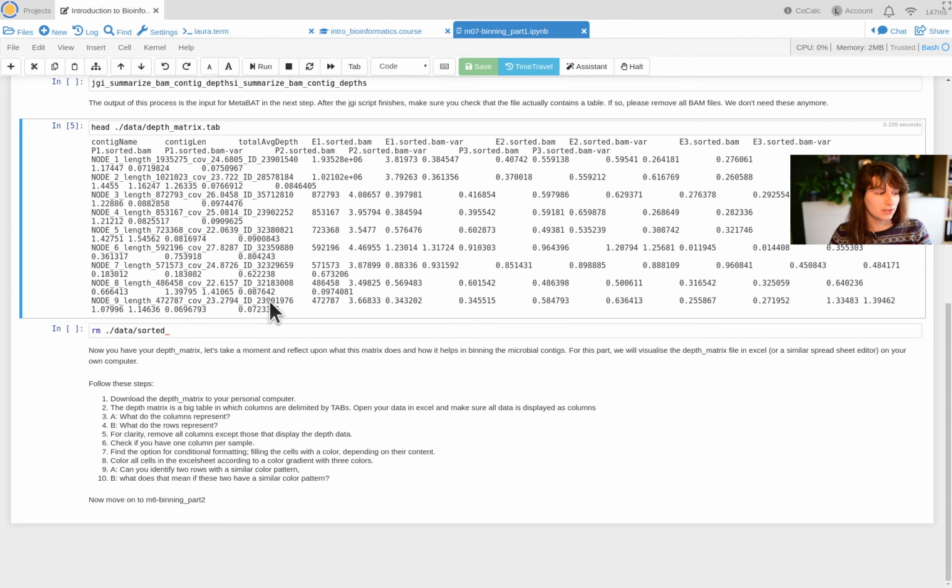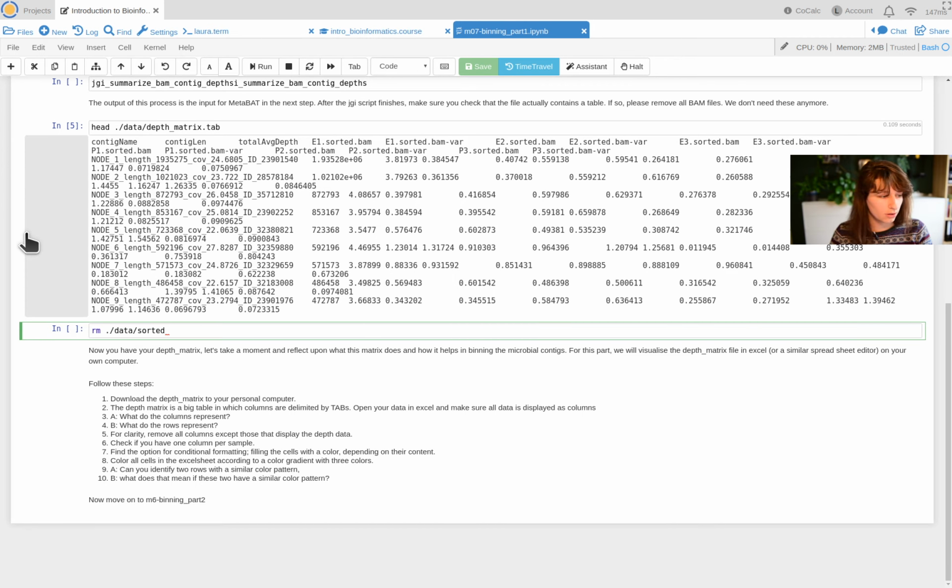Okay, so then there's this exercise below. One of the things I ask you to do here, and that's something that you normally never do, is to remove some of the data that you've created. We're now at 50 people on one server using one really big CPU and also one big hard drive.